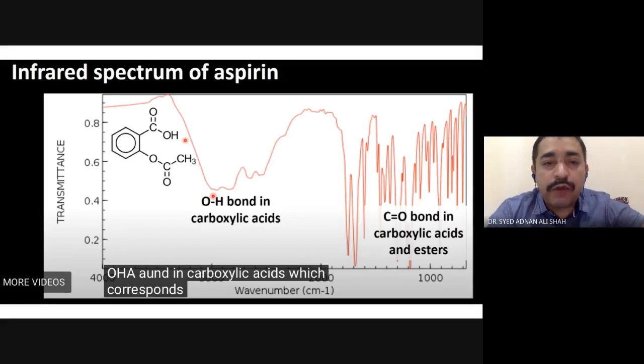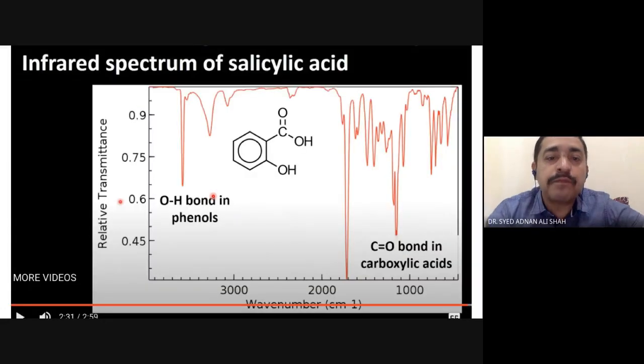If you see, first I can start from salicylic acid. In salicylic acid, the more prominent functional groups are the hydroxyl functional group and the carbonyl of the carboxylic acid. Hydroxyl group is here and also here.